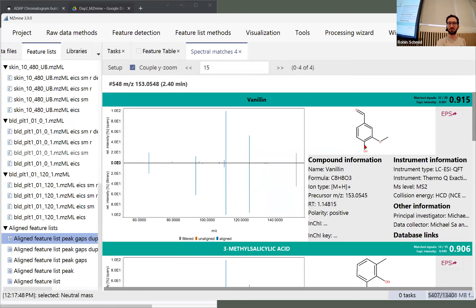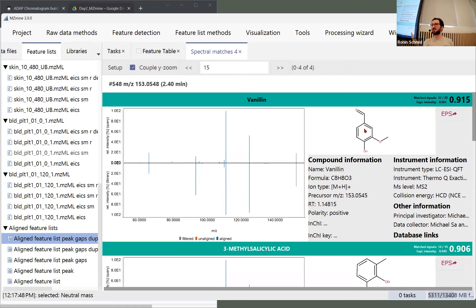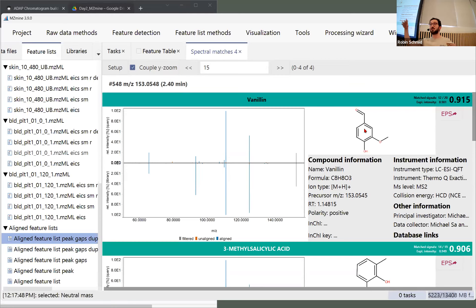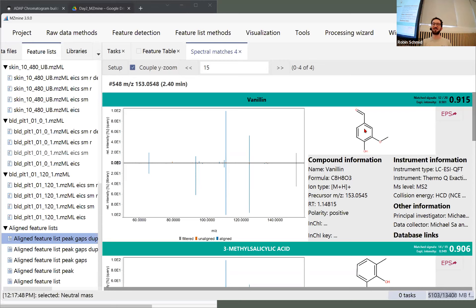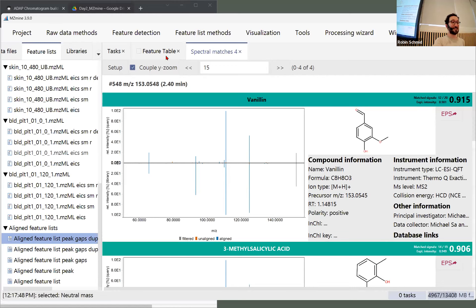We get the in-silico annotation, the spectral library matches, and some other tools to work on it — hopefully they all tell the same story, but they'll also show there's some ambiguity. How can you know the hydroxy group is really on that side of the ring and can't be shifted producing a very similar fragmentation pattern? If it's a hexose, how many hexoses are there? If we have a phenolic glucoside or polyphenol with glucoside, the charge often remains on the polyphenol with hydroxy losses, and the sugar is just cleaved off — so we don't know which sugar was really attached. Always question yourself.